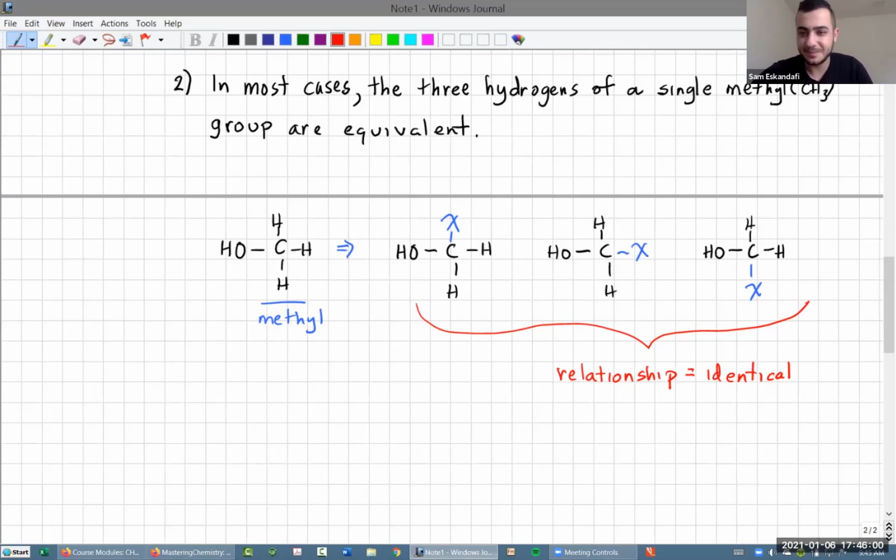It's fine. Yeah, I'll show you some interesting cases tomorrow where 2 methyl groups that are attached to the same carbon, usually 2 methyl groups attached to the same carbon are equivalent. But in some cases, because of stereoisomerism or magnetic fields being different, they become non-equivalent. I'll show you some of those tomorrow. We're going to talk about stereochemical isomerism or non-equivalence tomorrow. Okay. All righty. So that's our basic equivalence.